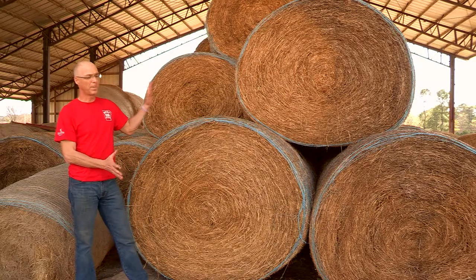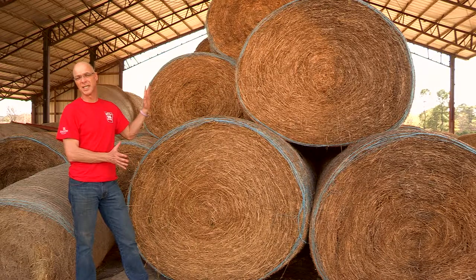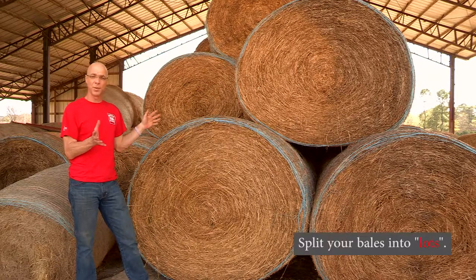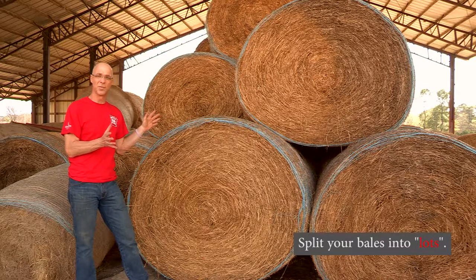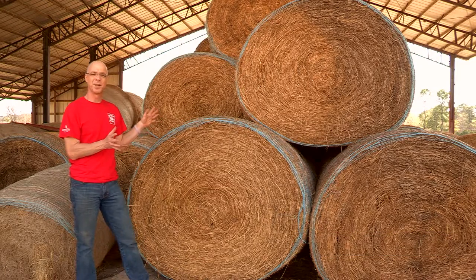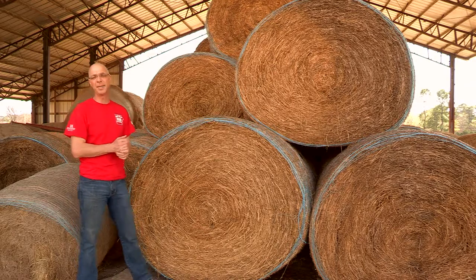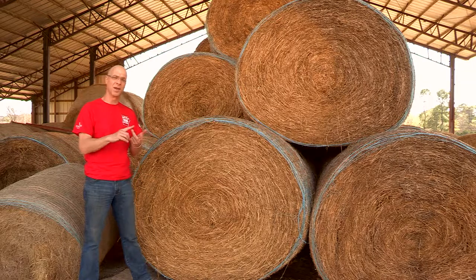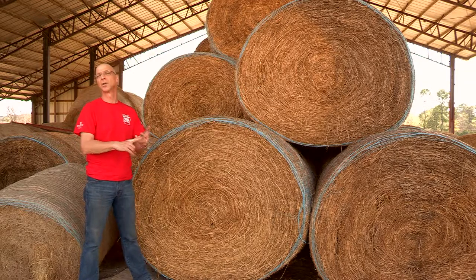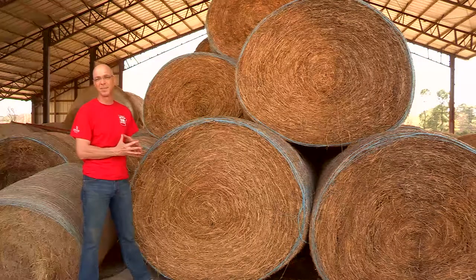The way you go about sampling all your bales from the field is the following. You may end up with 20 to 30 bales from a single field, and the idea is to get a representative sample of that entire lot — whether defined by forage type, field, or time of year sampled.